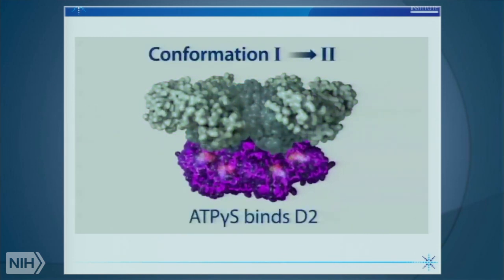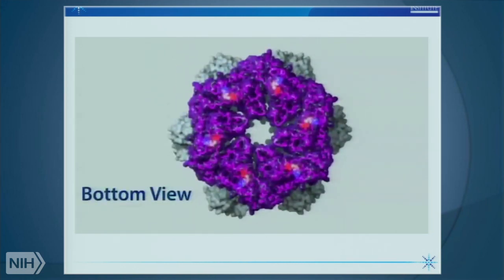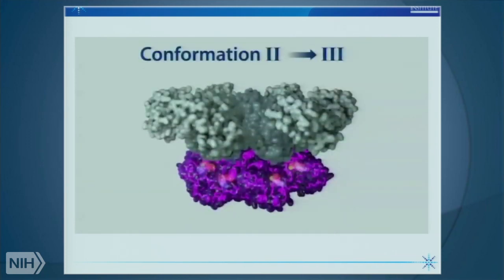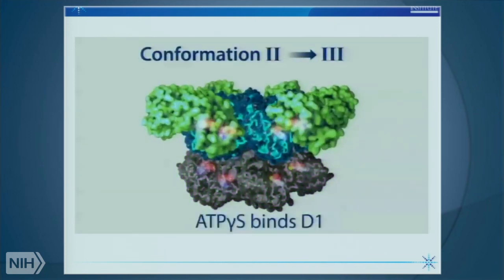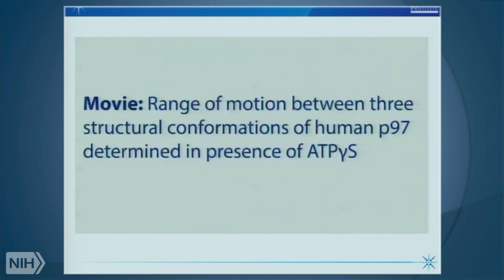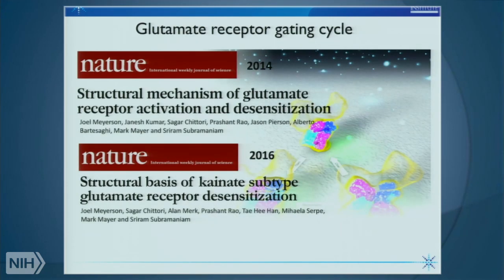And what you see here is because in the cryo-EM work that we did, we were able to resolve simultaneously the presence of multiple conformations. We show that the binding of ATP, the 2 molecules of ATP, first led to a change in one of the ligand nucleotide binding domains, followed by a second set of changes. And it's these kinds of conformational changes that take place in these enzymes that really are the power of cryo-EM.